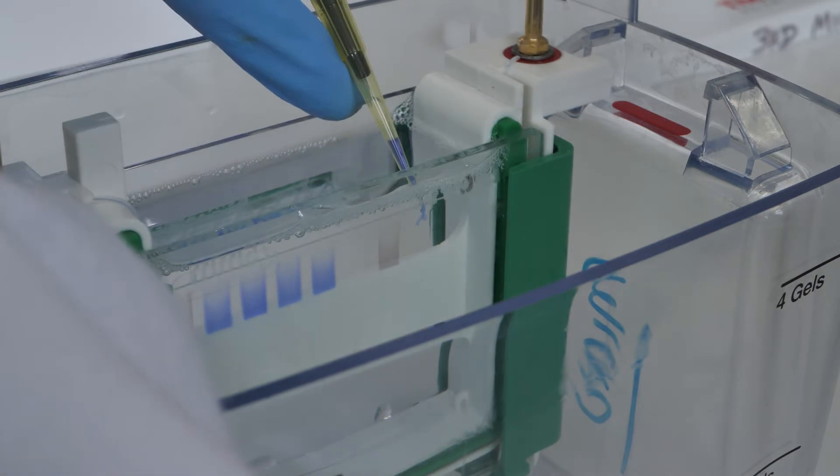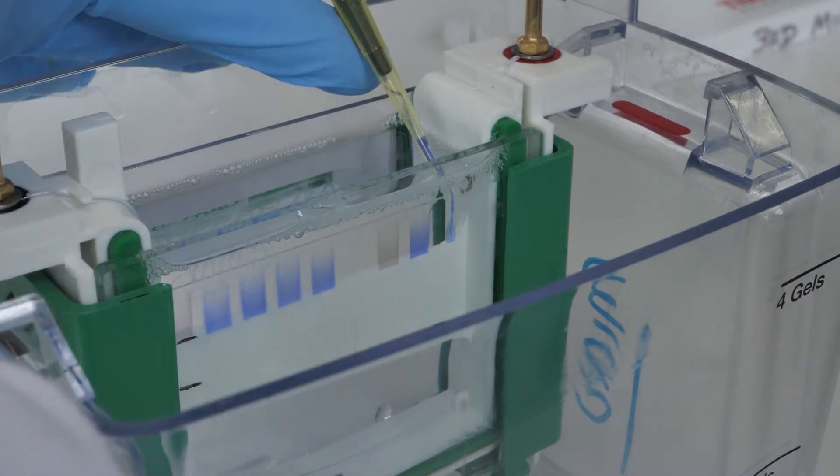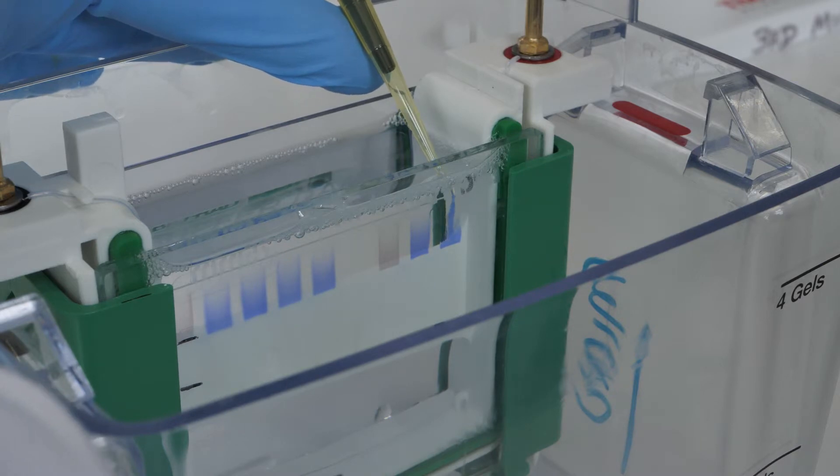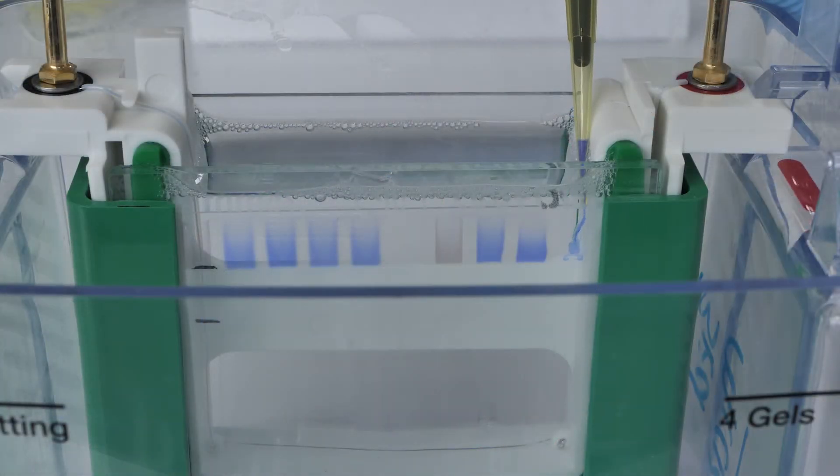Line 7 protein marker. Line 8 time 0. Line 9 time 3 hours. Line 10 time 16 hours.